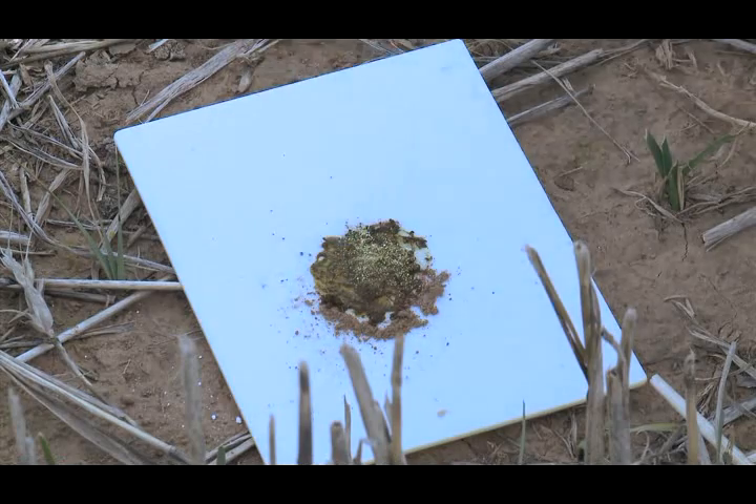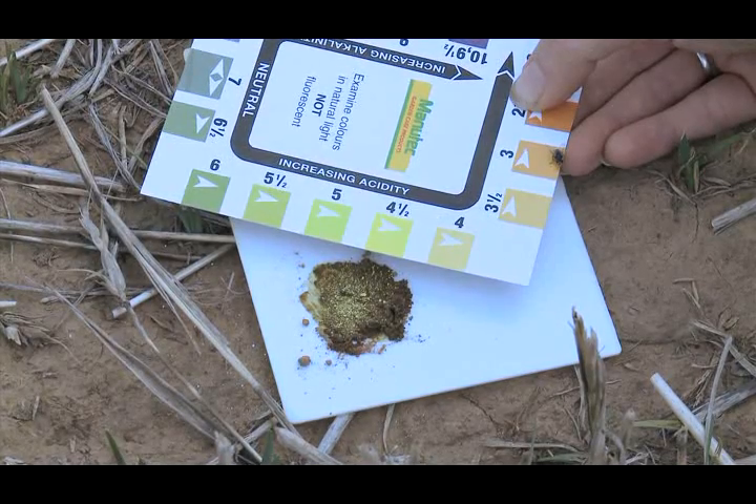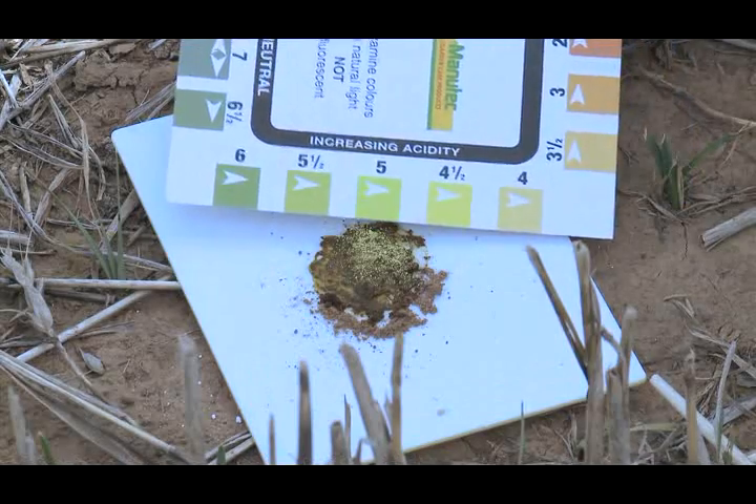Step 6: Wait approximately 1 minute. Step 7: Assign a soil pH value by comparing the paste to the colour card provided.